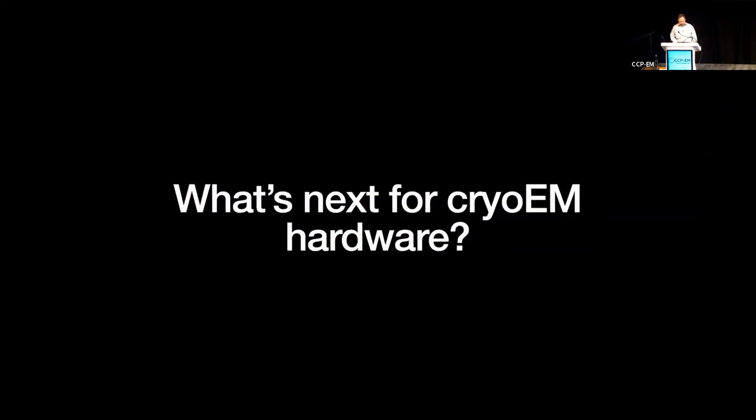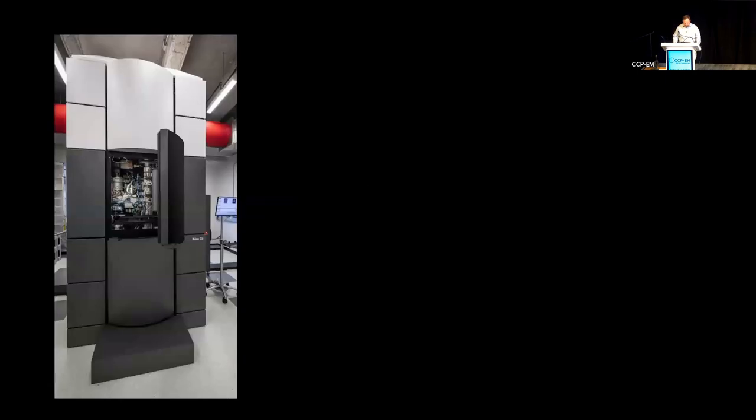And in particular, today I'm going to mostly talk about improvements in cryo-EM hardware for single particle, at least to start. And so the question in my mind is, this is a nice electron cryomicroscope, and it has an extraordinary amount of technological development in it. It's all hidden inside this box, but there are years, if not decades, of effort from hundreds of people to make something this extraordinary that can do the things that we do for it.